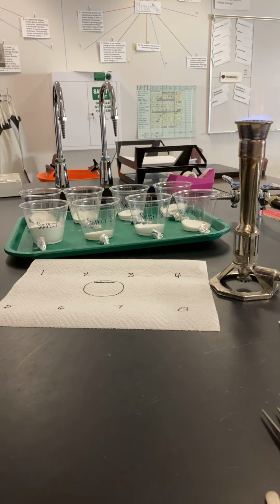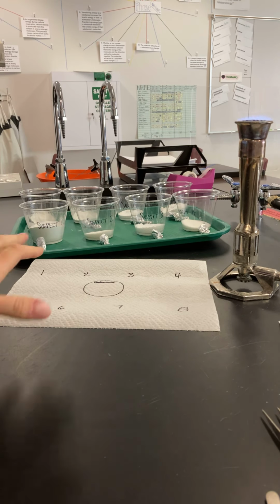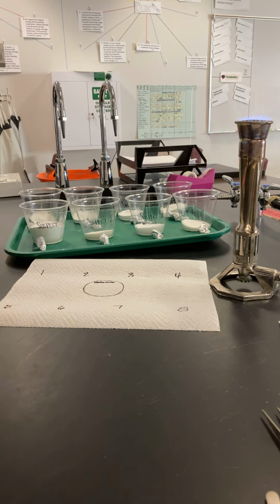Okay. All right. So I'm just going to kind of work through these. And then what I'm going to do is after I burn each of these, I'm going to obviously give you guys a description as best I can using my senses. And then I'm going to kind of try to dump them out on this paper towel so you guys can take a look at as best as possible what they look like afterwards.